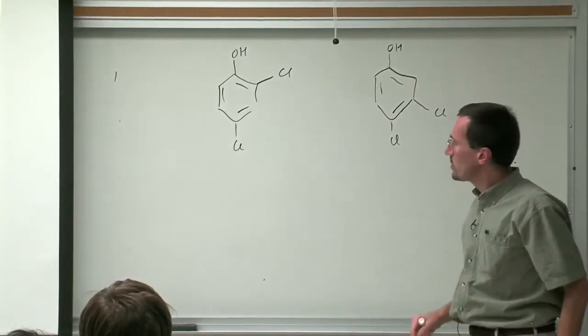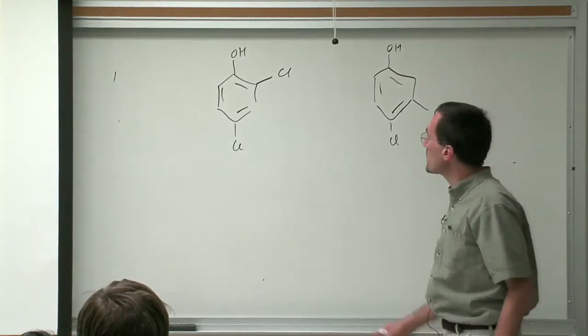That would be a tough one to do based on coupling patterns in the proton NMR.